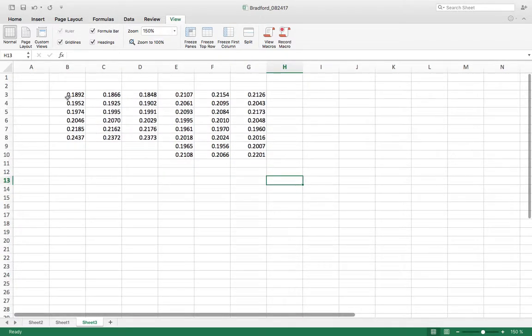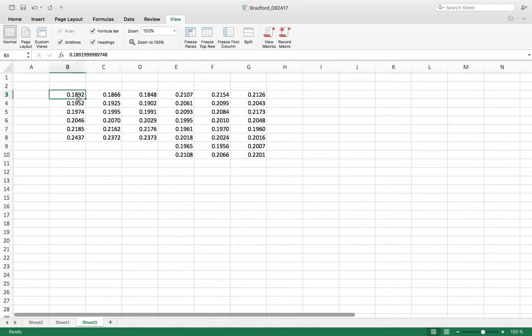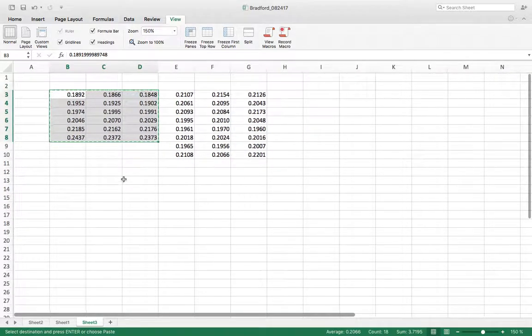Okay, so what we're looking at here is absorbance data. These are all different data points for sets of protein, and there's a triplicate of each set. So these three right here, for example, are replicate 1, 2, and 3 of a certain set. So let's do this first. This is our raw data, so I'm going to show you guys what this is first.